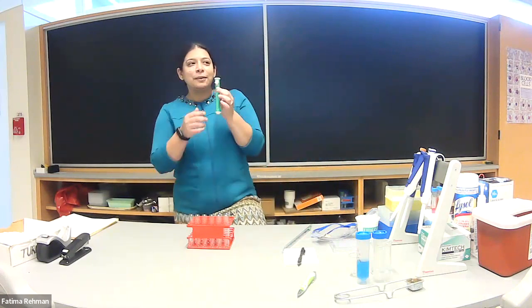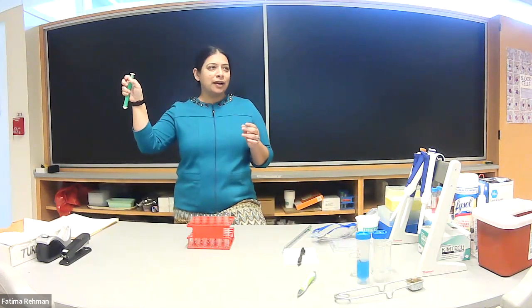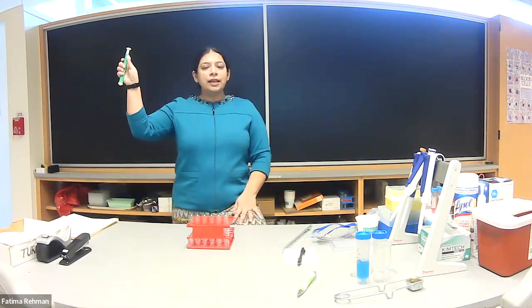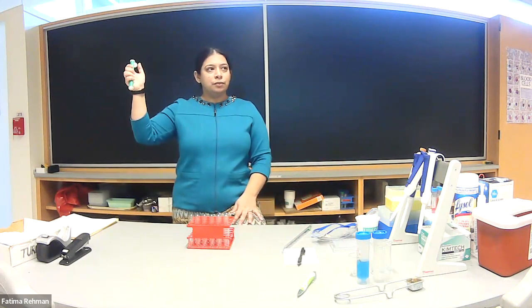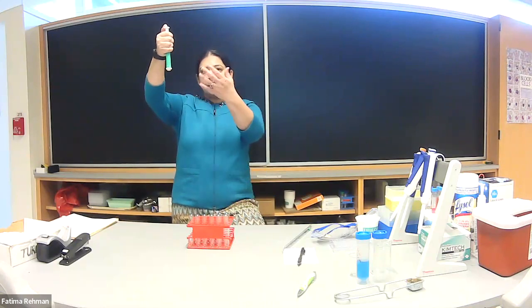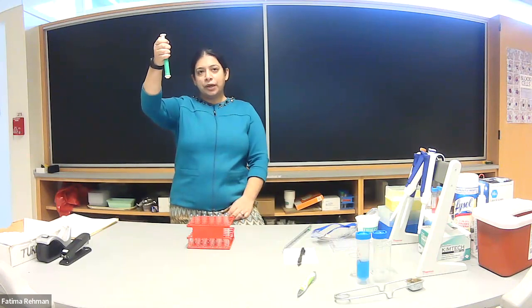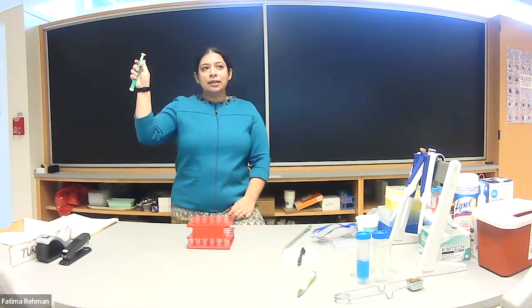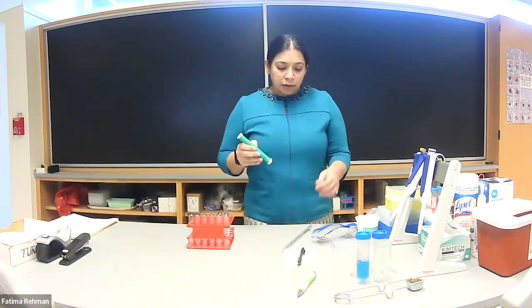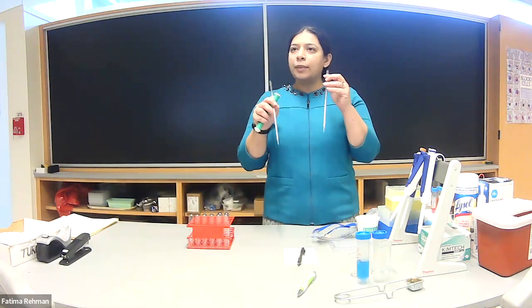These pumps have a little dial on the side you can dial up or down. When you move the dial down and the liquid moves up, that picks up the liquid. To release the liquid, push it down. You can also push it down directly, but do it carefully so you can control how much you're releasing. It's usually better to use the dial rather than just pushing.